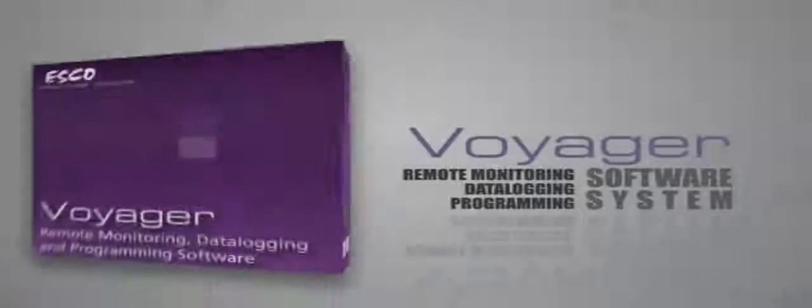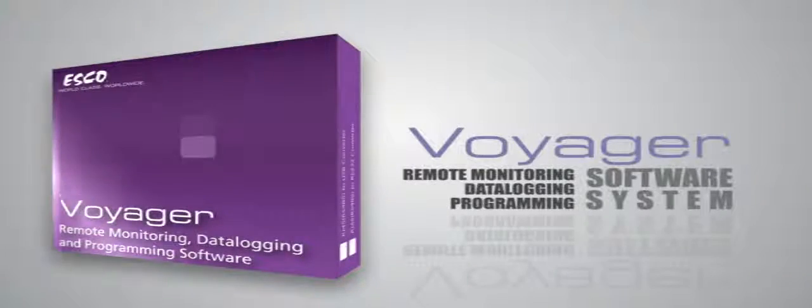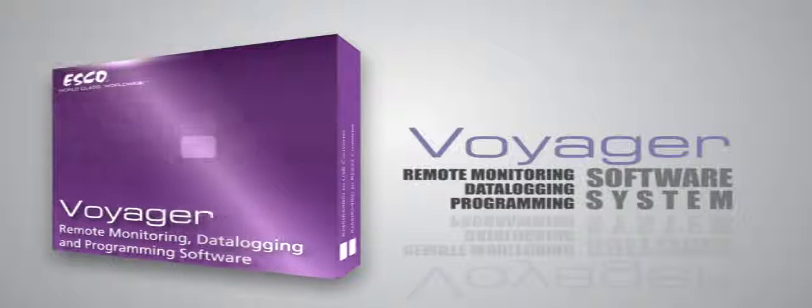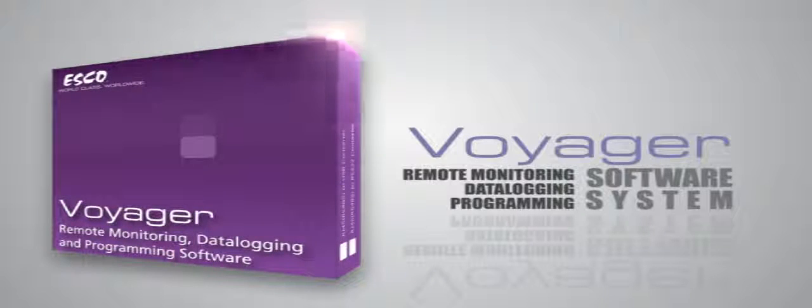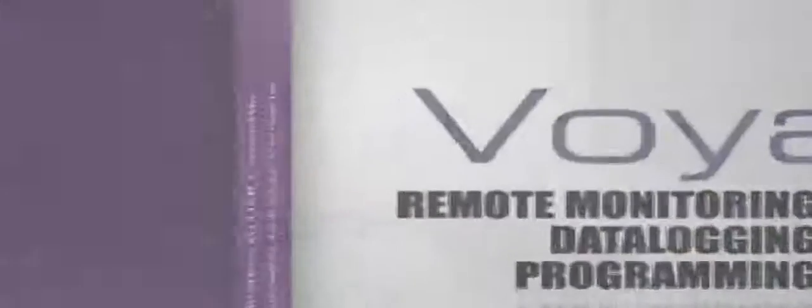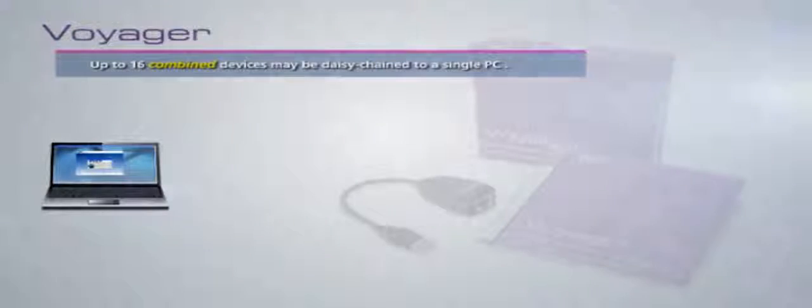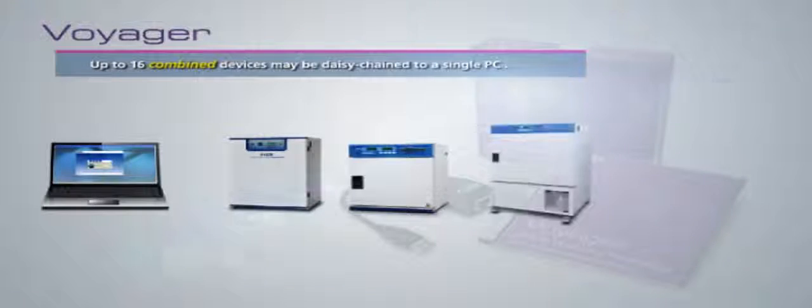The Esco ERT freezer is compatible with Esco Voyager PC based software system, which is developed for remote monitoring, data logging and programming device configuration of Esco controlled environment laboratory equipment. Up to 16 devices of equipment may be interfaced to a single PC.